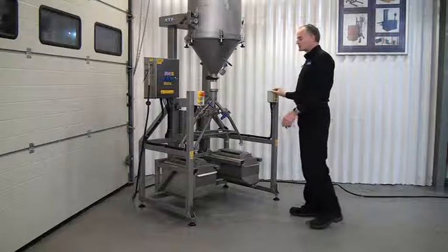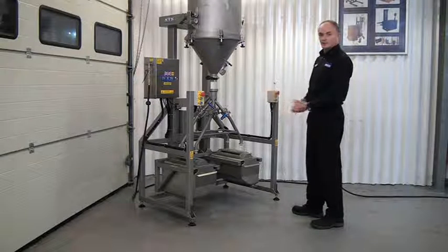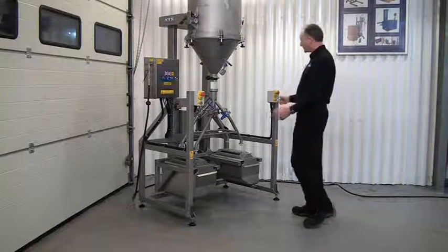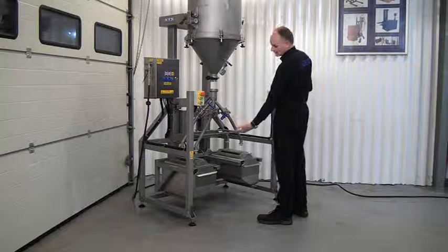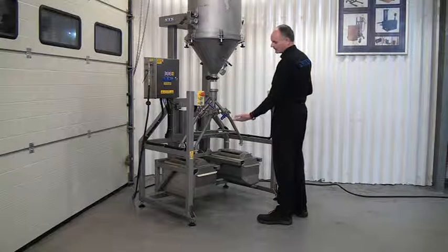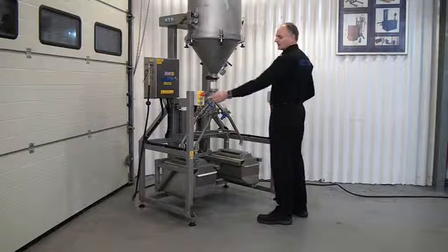It's the operator's responsibility to check that everyone is clear — no one's at the side or the back of the unit — and we press both green buttons at the same time. You'll notice it'll bring the hoppers up to the manifold and it'll bring the manifold up to the top tank. Let's do that now.